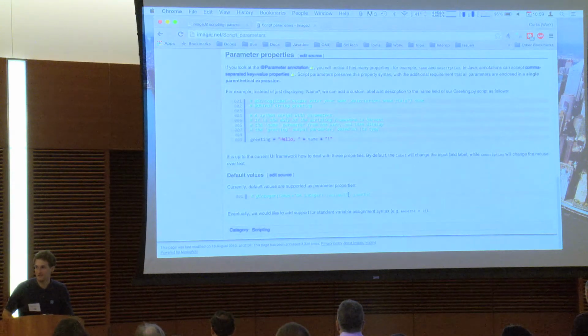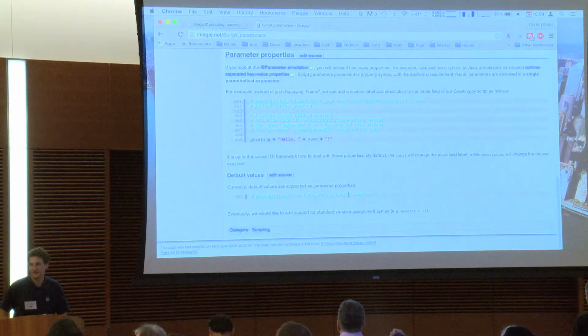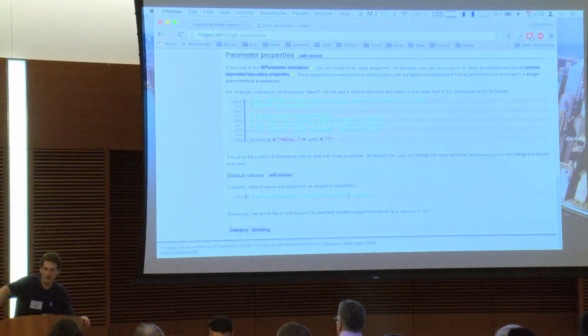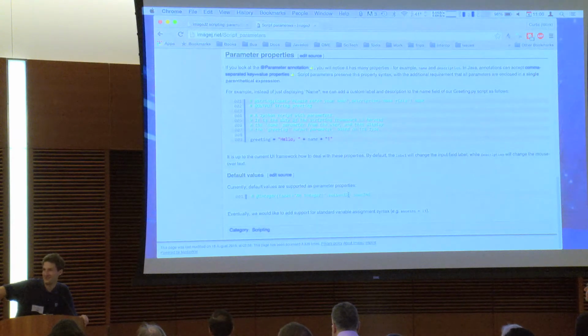And that does have some caveats, right? Because it's not really properly typed. But you can do a default color, for example. Because we use our SciJava converter framework, which, if you remember Mark's talk with MATLAB, is very magical actually. So a lot of things will let you convert from string. I think that we have that right now, if you specified your color as like an RGB comma separated thing, the converter will just work. Give it a try. Yeah, this is quite nice.